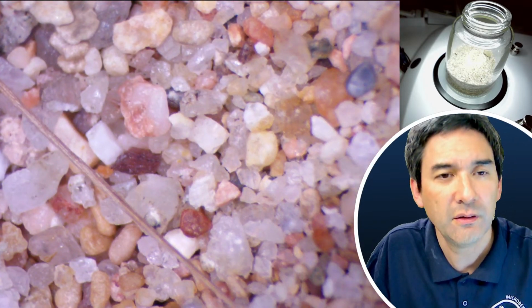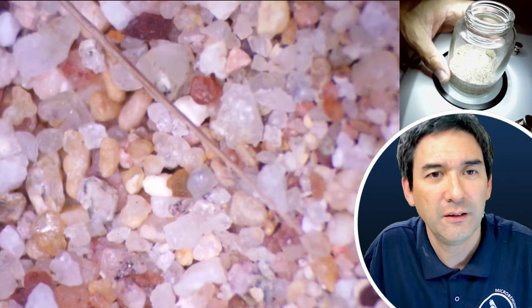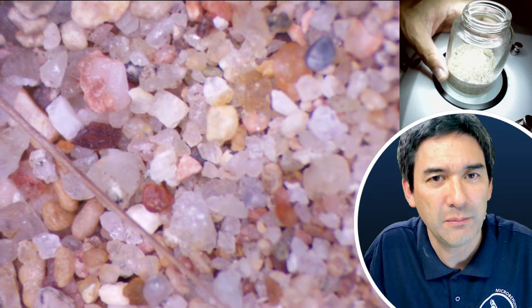This is the French sand. Okay. See, it's not only sand. There are also some plant materials in here.